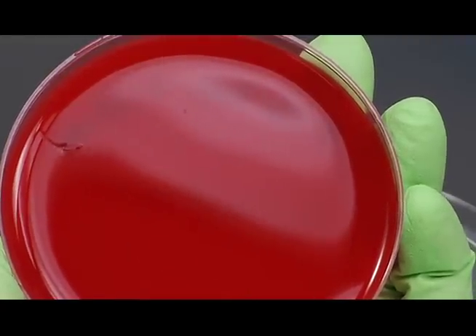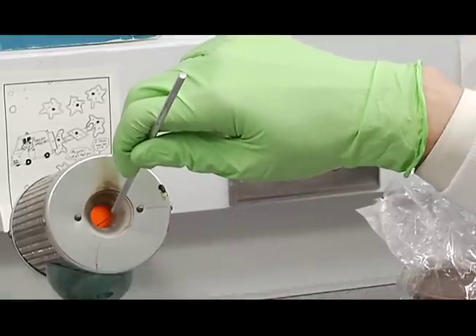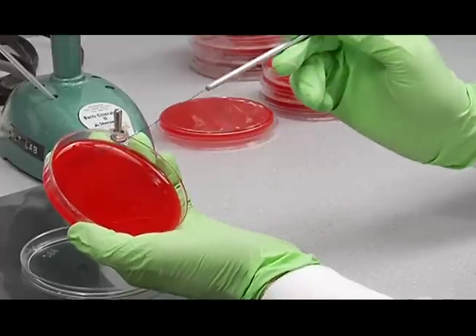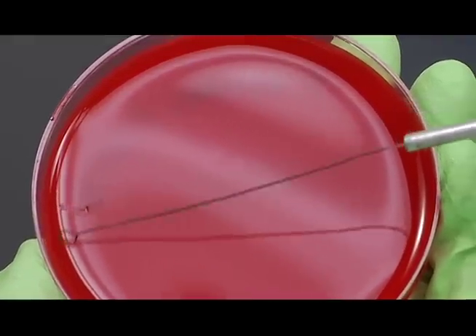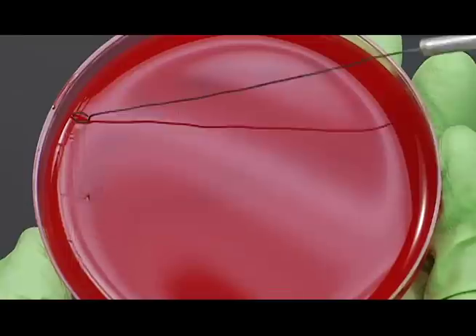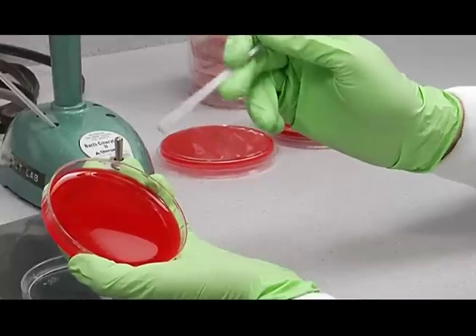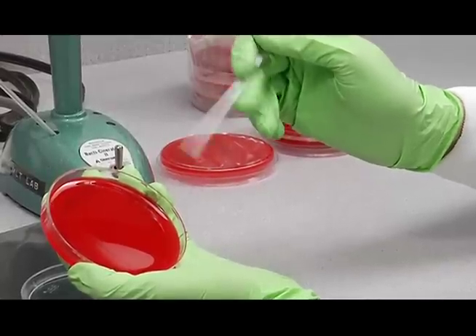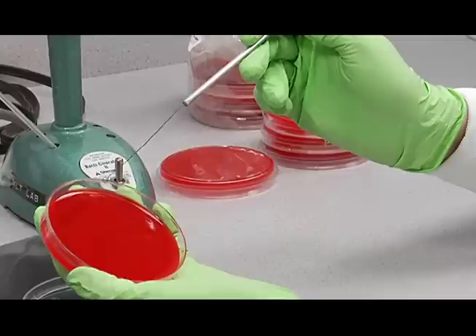Then you're going to flame your loop, and streak across it all the way across the plate. You'll notice that when you streak like this, your fingers do the streaking — I'm just using finger motion to make the loop move across the plate.